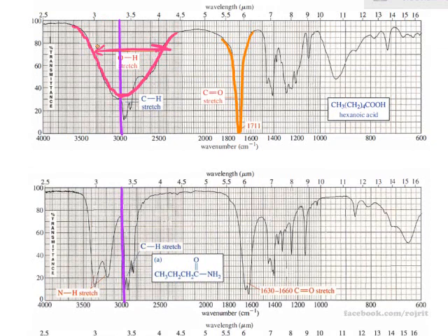The amide, you have absorption of the carbonyl. But the carbonyl of the amide is shifted to the right-hand side, around 1600, different from other carbonyls that appear at 1700. That means the carbonyl is weaker than the usual carbonyl group.